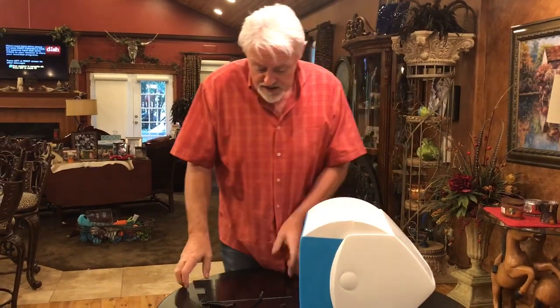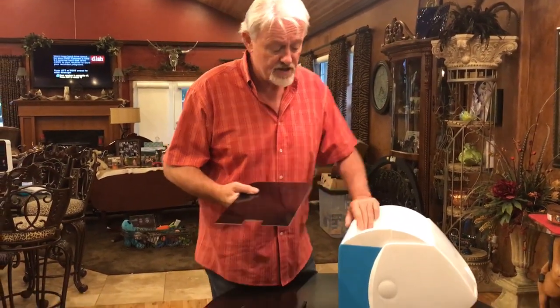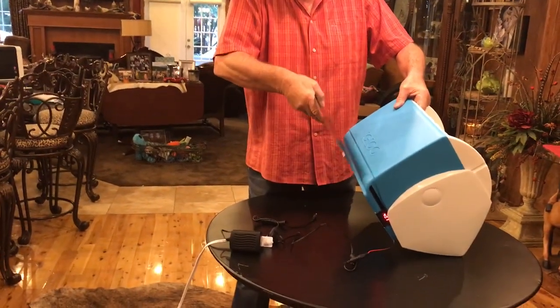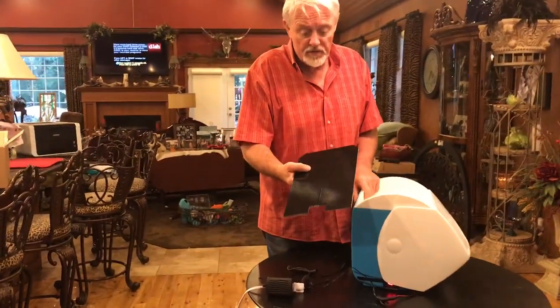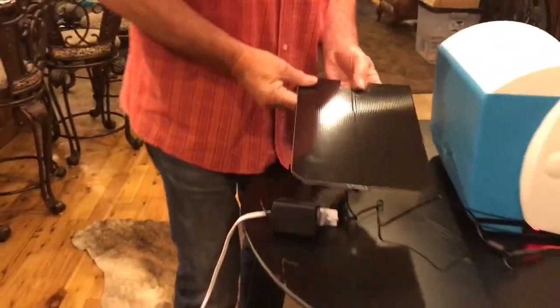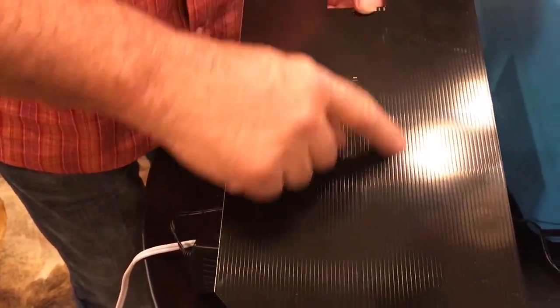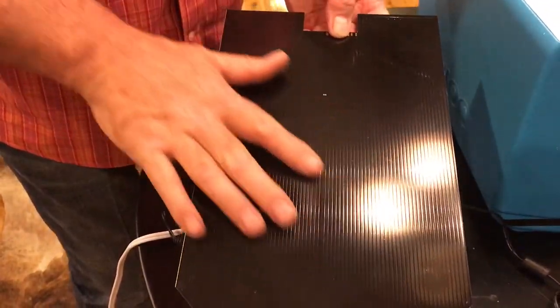Okay, so here's what we've done. We've now manufactured actually a little heating pad. This is buried inside the guts of this thing. You can't see it, but this thing runs on 12 volts. I'm just getting close on this, Tammy. What this is, is a heating element. It's actually got 40 lines in it, so it's an extremely uniform heat.